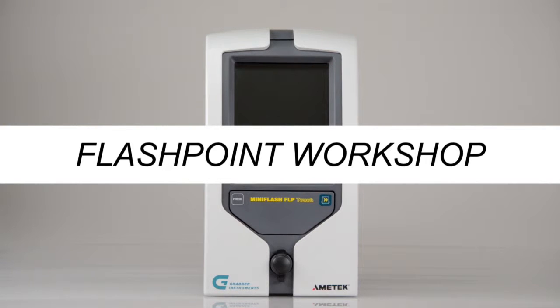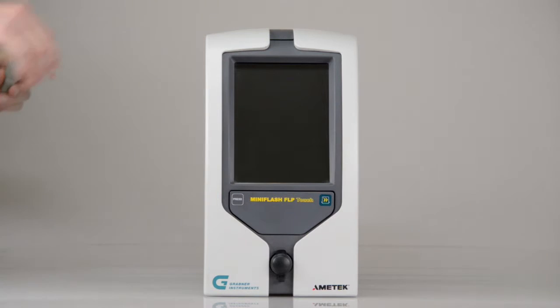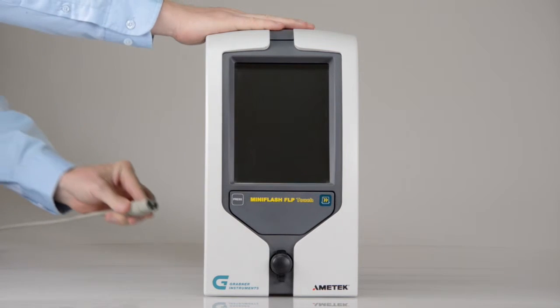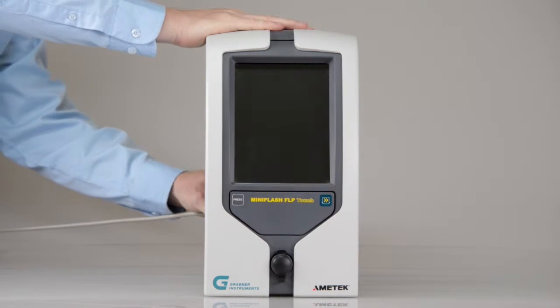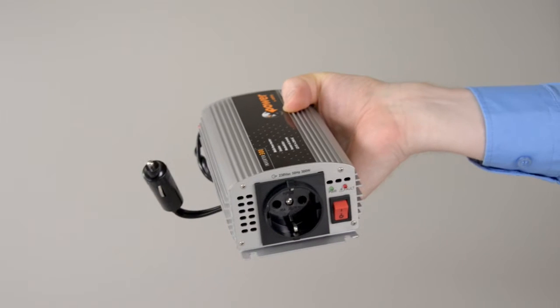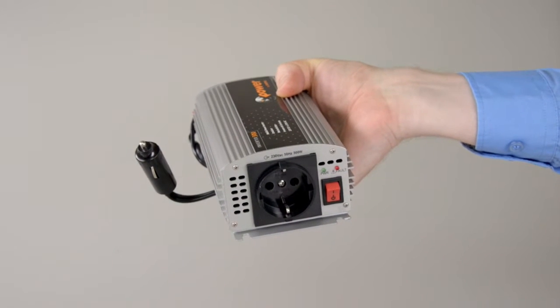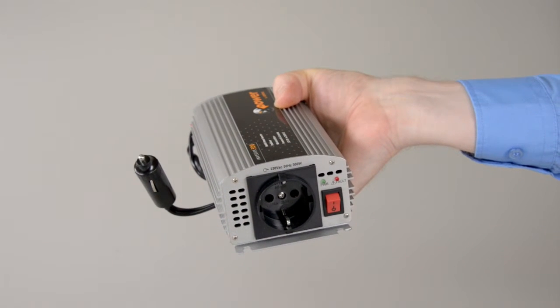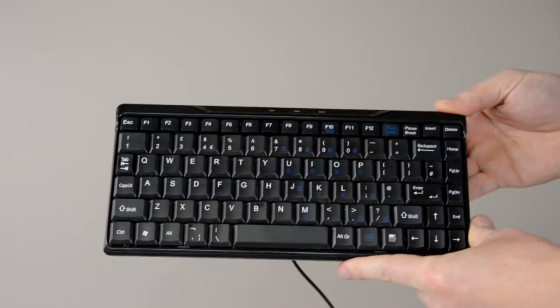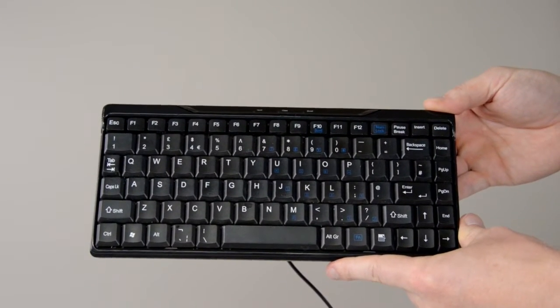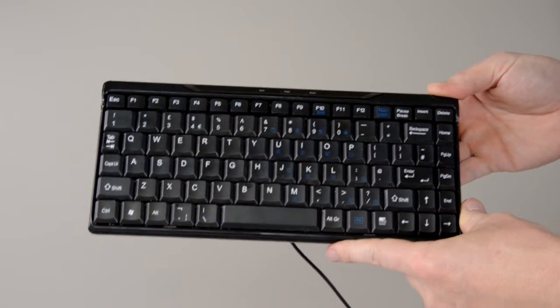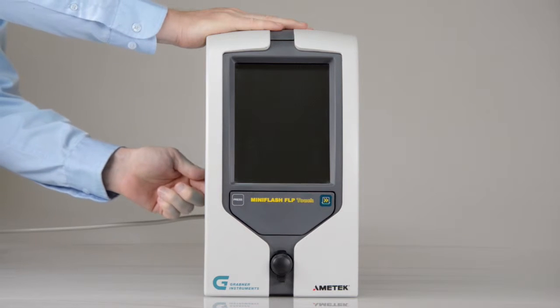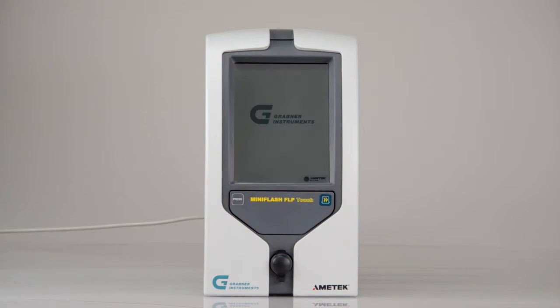Flashpoint Workshop. Workshop preparation: Connect the power cable to the rear side of the instrument. If you connect to a vehicle battery, a 12-volt power converter is required. If you want to use a keyboard, attach it to a USB port on the rear side of the instrument. Turn on the analyzer and log in.